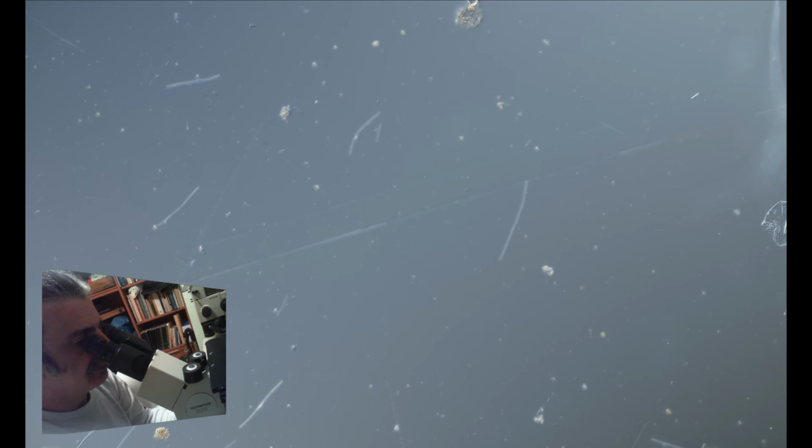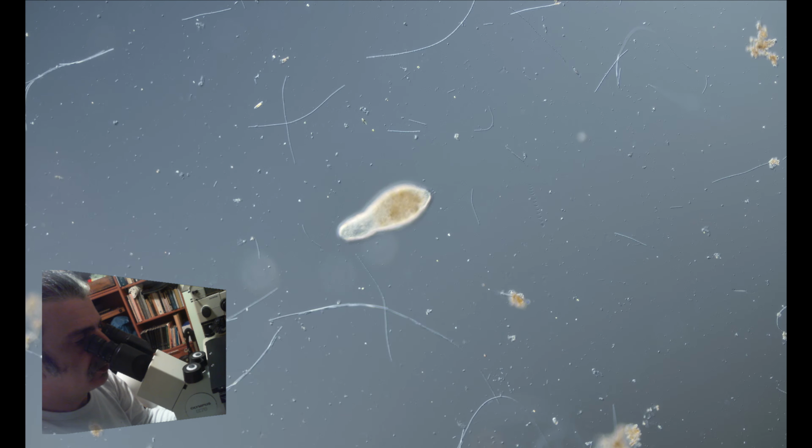Let's see if we can spot another thing that we haven't talked about. Maybe Trachelomonas that I've seen earlier. And then we'll move to the top layer, the bacterial layer. That's a worm.